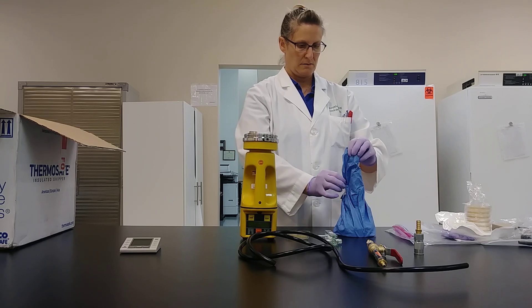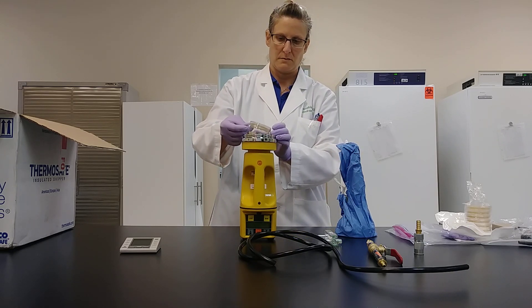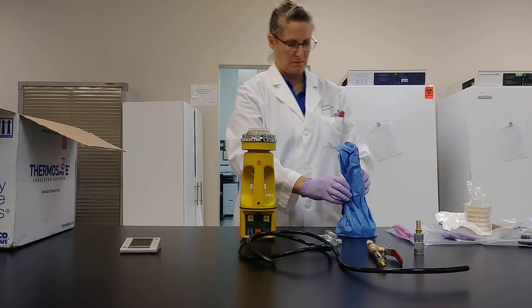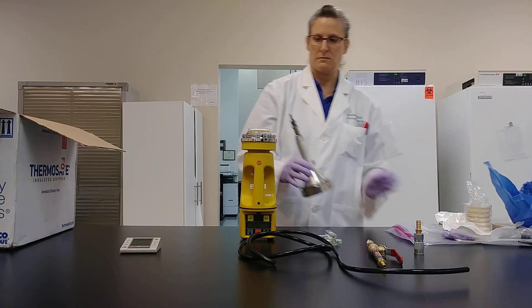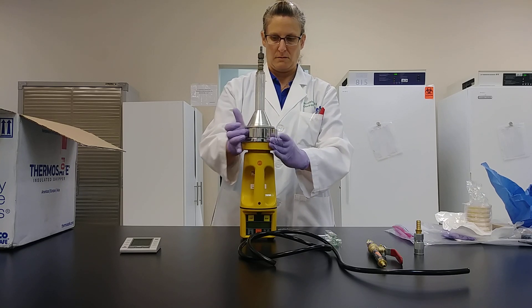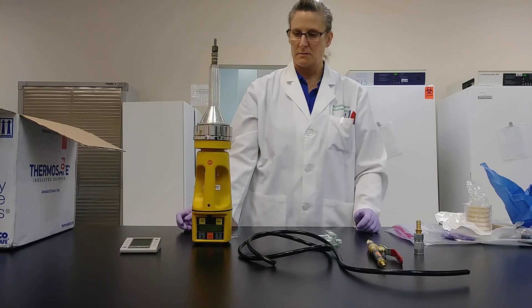Place your sample plate on top of the SAS using the brackets to hold it in place. Remove the sample lid and place the SAS nose onto the SAS air sampler. Be sure your SAS is in the off position.